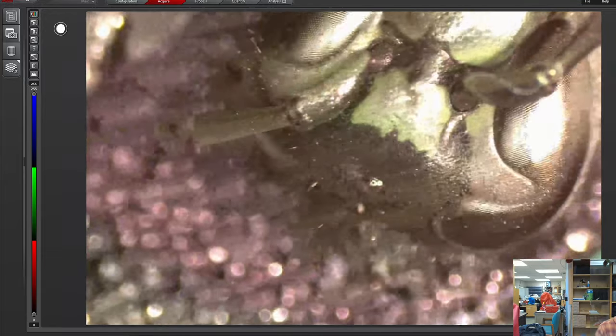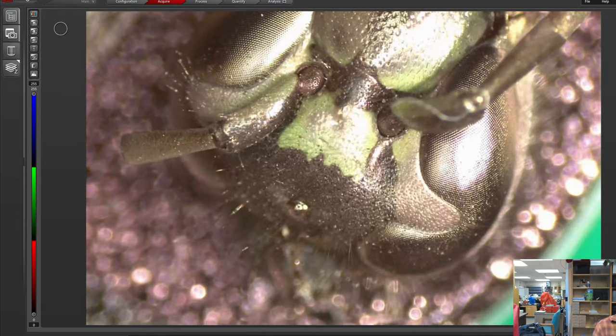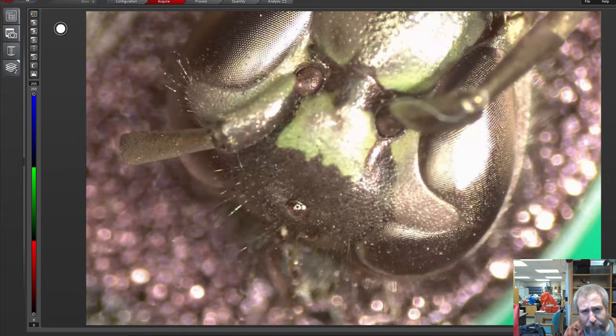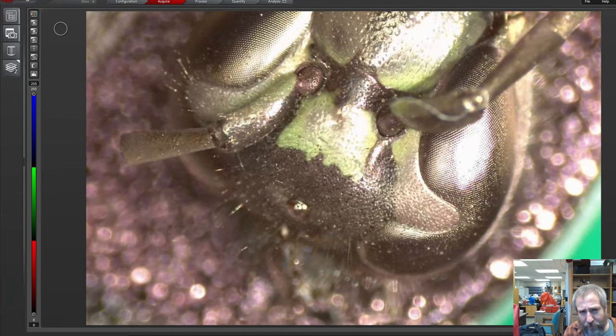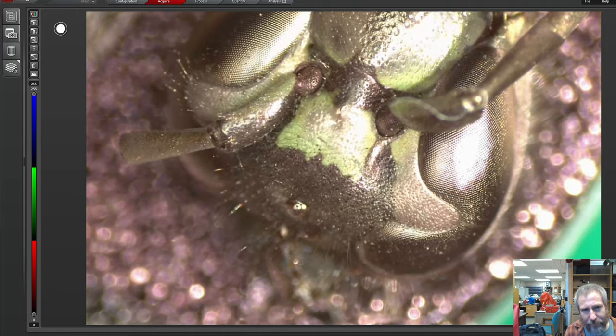So you can actually still see a bit of the real color on this thing, which is kind of cool. Even though it's been plated with gold, blinged out, hopefully you can see the three eyes are here. Those are their light sensors. But you can still see a bit of the yellow or white. I guess this was a white-faced hornet, so this is the white part in the center of their head here, which I think is kind of neat.